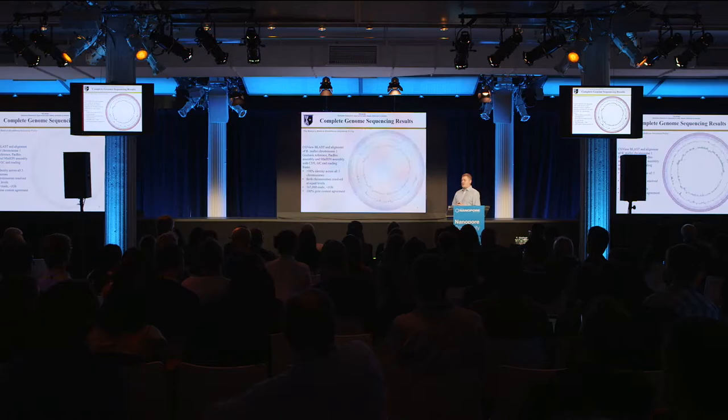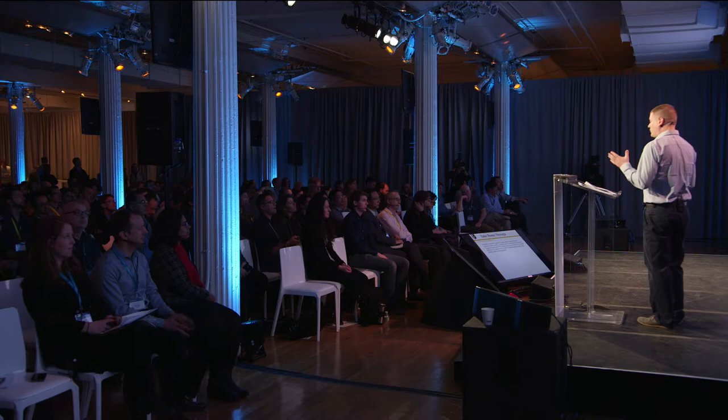And this is chromosome 1 of 2 chromosomes in the mallei genome, and again, it shows essentially the same thing, 98 to 99% identity across the entire thing, circular assemblies, 100% gene content agreement yet again. So, take-home message, nanopore sequencing can rapidly identify within a couple of hours of acquiring a plate in a clinical lab, theoretically. We could even pull directly from a primary plate because we mixed these samples together; the colonies could have come from a swipe of a primary plate. Seems like it would work.